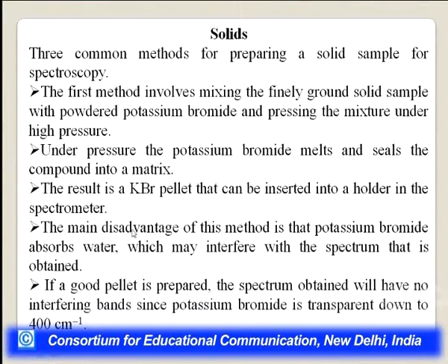The main disadvantage of this method is that potassium bromide absorbs water, which may interfere with the spectrum that you observe. If a good pellet is prepared, the spectrum obtained will have no interfering bands, that is undesirable bands, since potassium bromide is transparent down to 400 cm inverse.